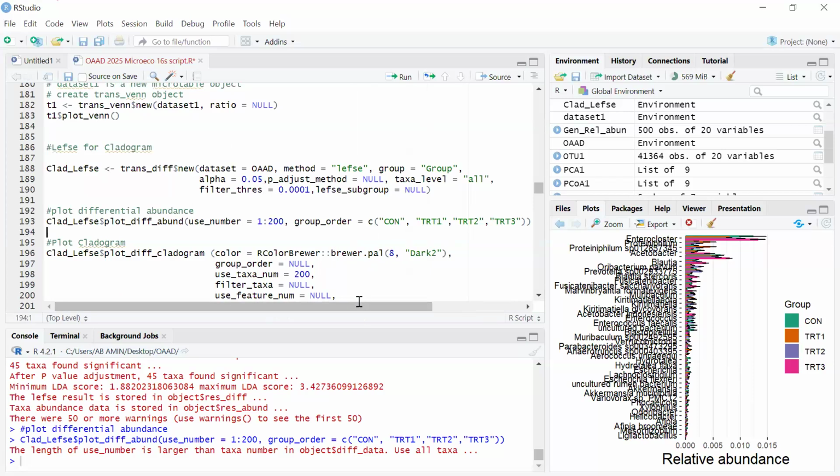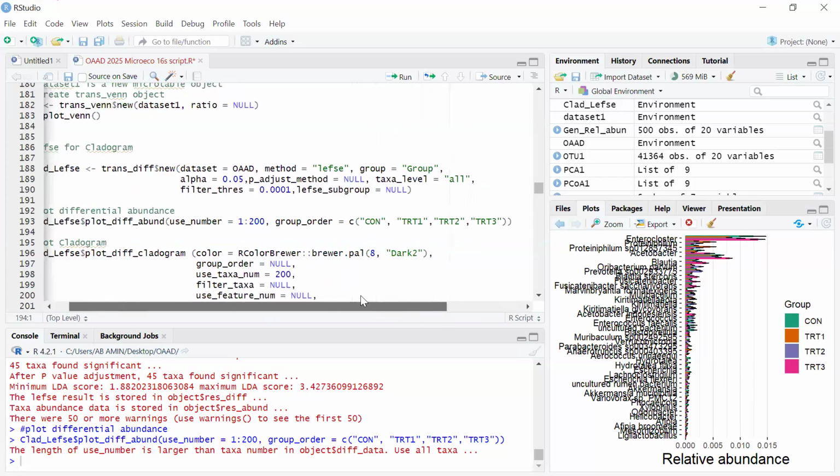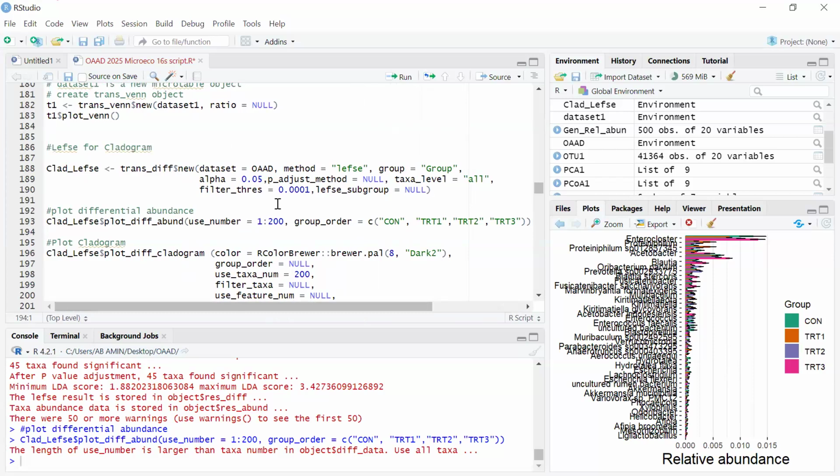Okay, I think I need to use ggplot for that. This one will waste our time. Let's just proceed. I'm not very conversant with the use of ggplot. So let's manage it this way, please. As I said, I'm still a learner with regards to R, though I have used it for about 3 years, but R never ceased to amaze me.